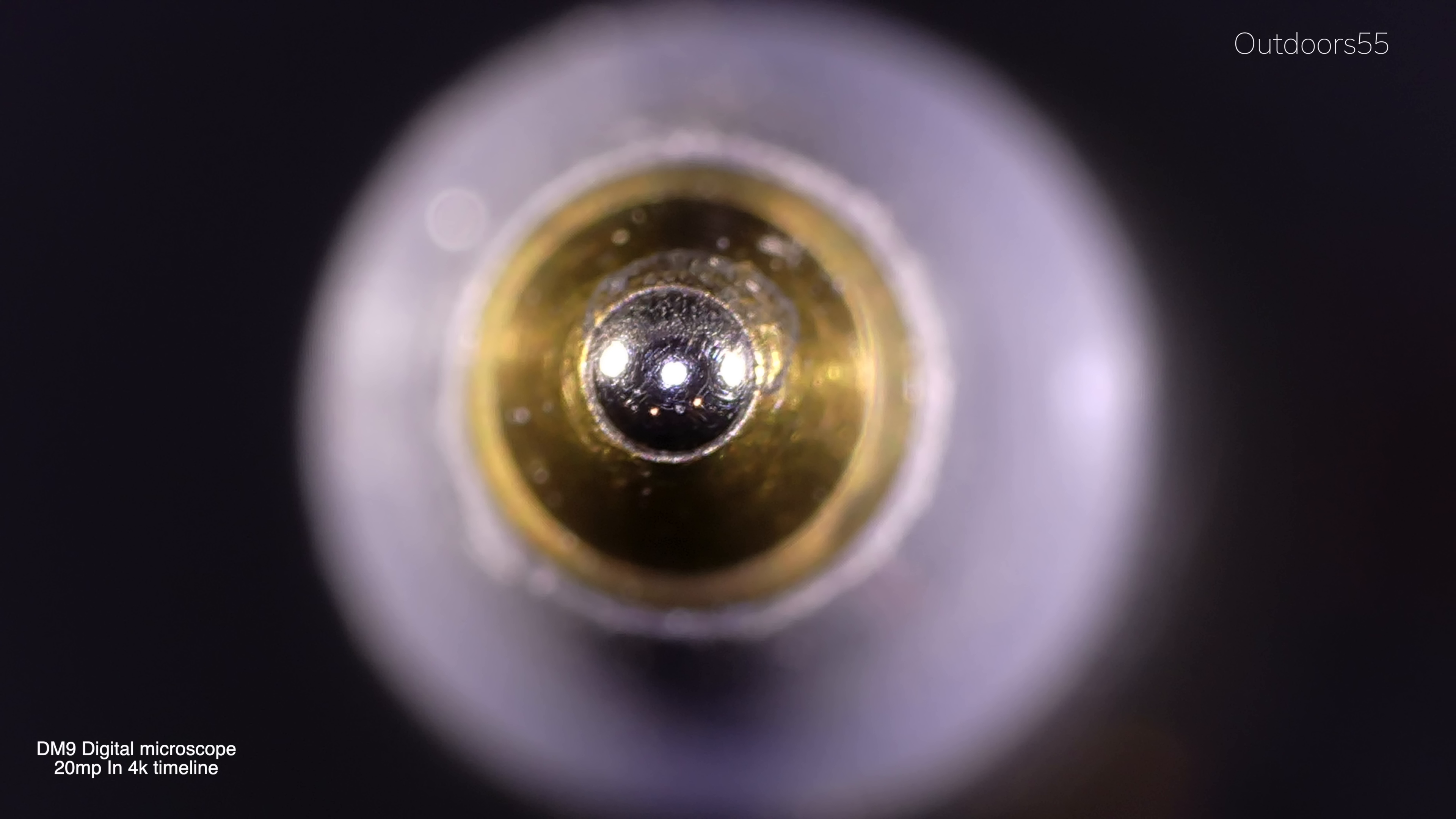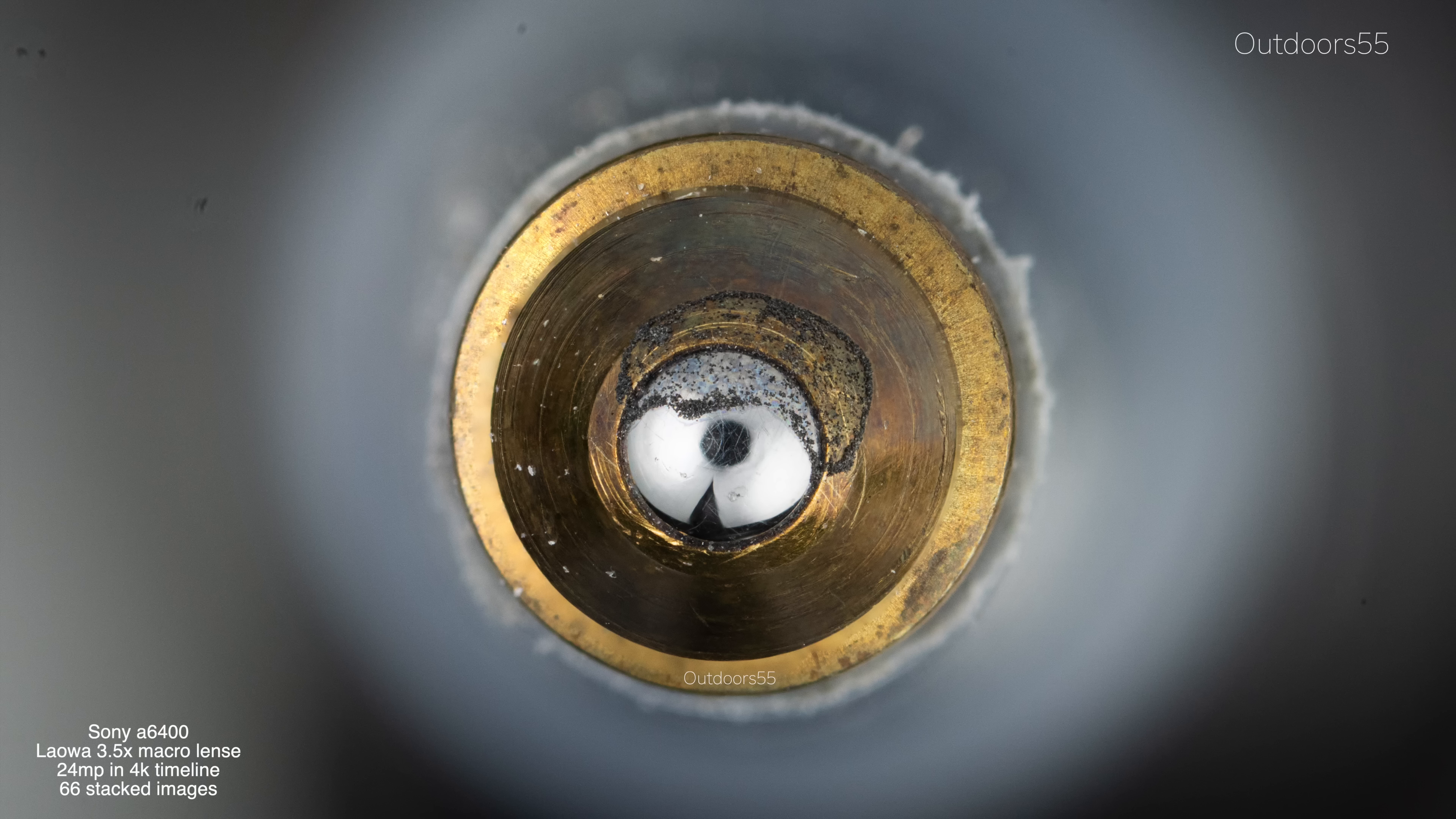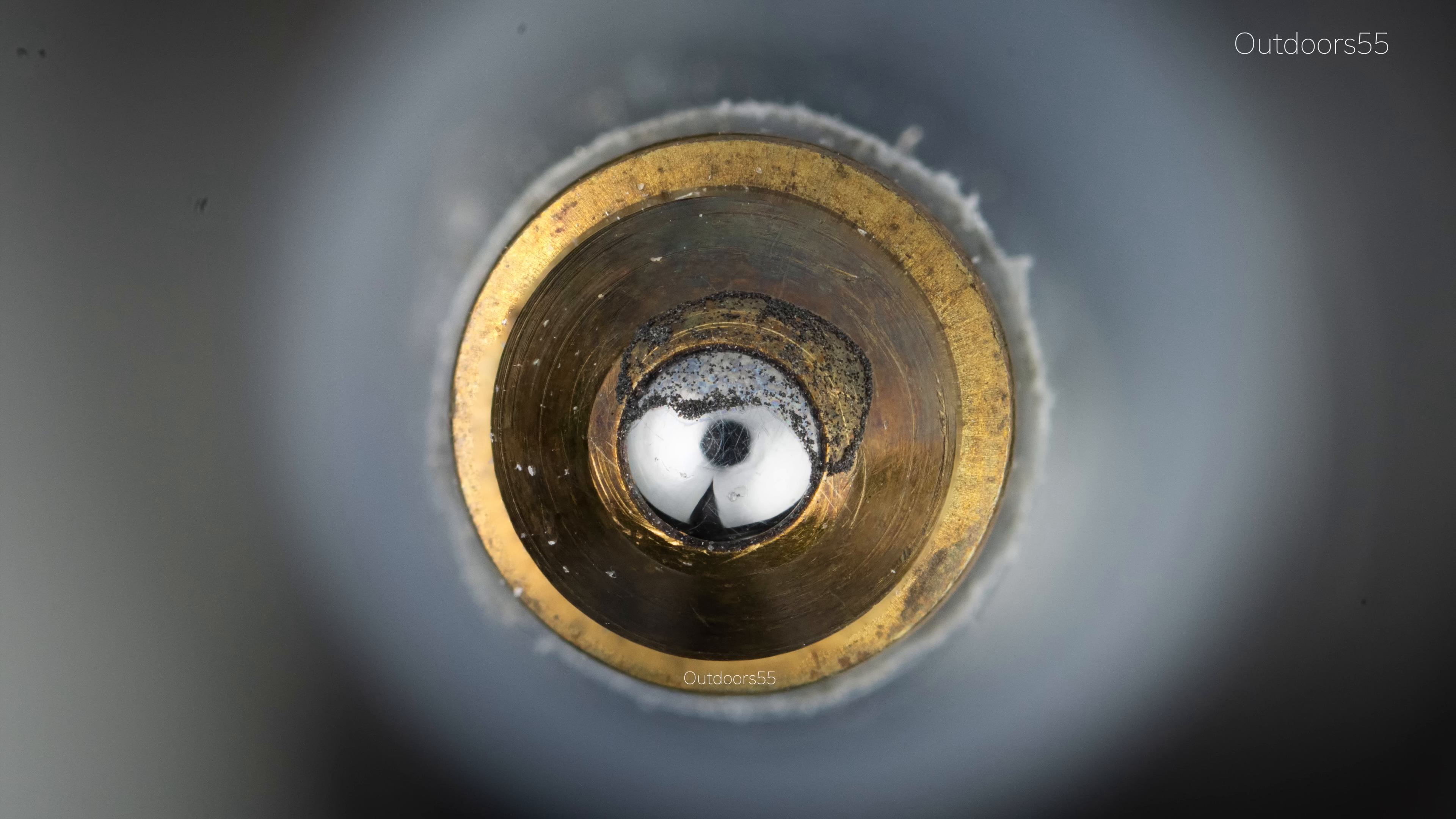Now let's compare this image with a similar magnification on our macro lens. So this is what a Sony a6400 with a 3.5X macro lens looks like. This image is a series of 66 individual images stacked on top of one another and combined in Photoshop to one single photo. Now, even this 3.5X macro is closer than our 1500X cheap microscope. And obviously the image quality is way better. But why is this?